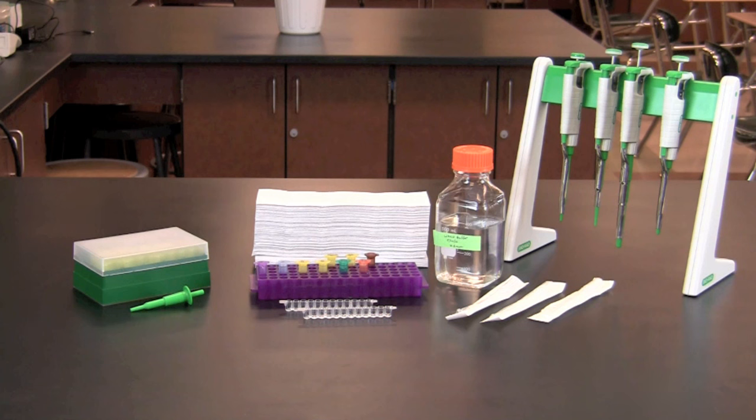In this video, you will learn how to perform a quantitative enzyme-linked immunosorbent assay, or ELISA. The ELISA uses antibodies to detect an antigen or antibody of interest by exploiting the tendency of proteins to adsorb or stick to a plastic microplate. In this activity, an ELISA will be used to measure the amount of an antigen present in a sample.